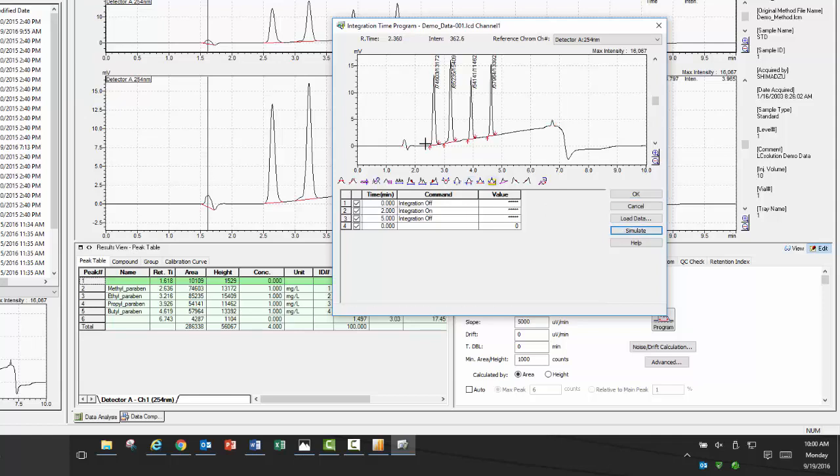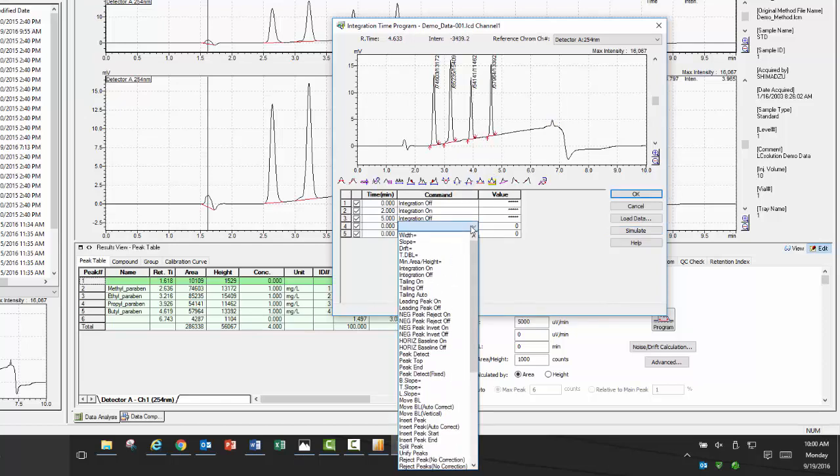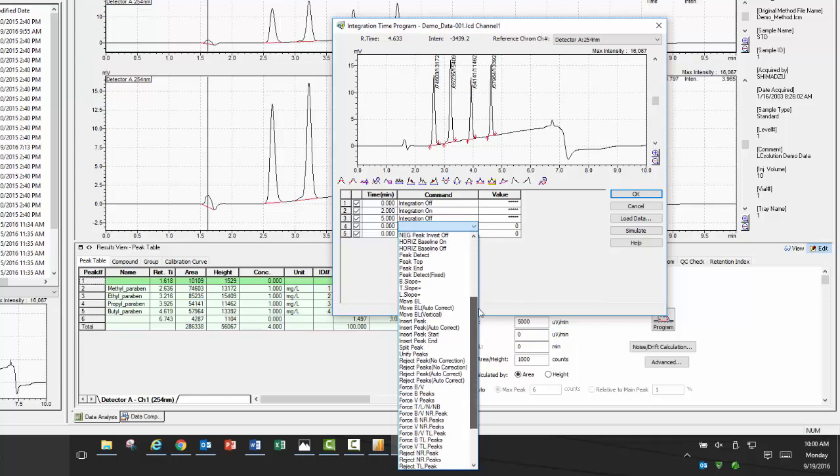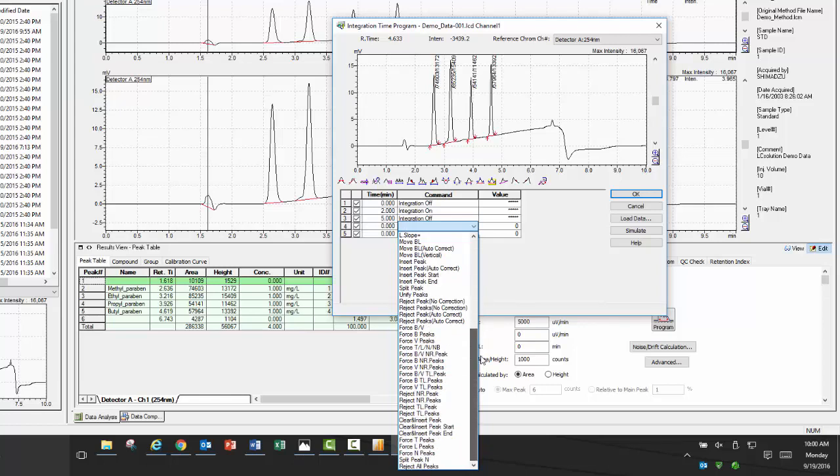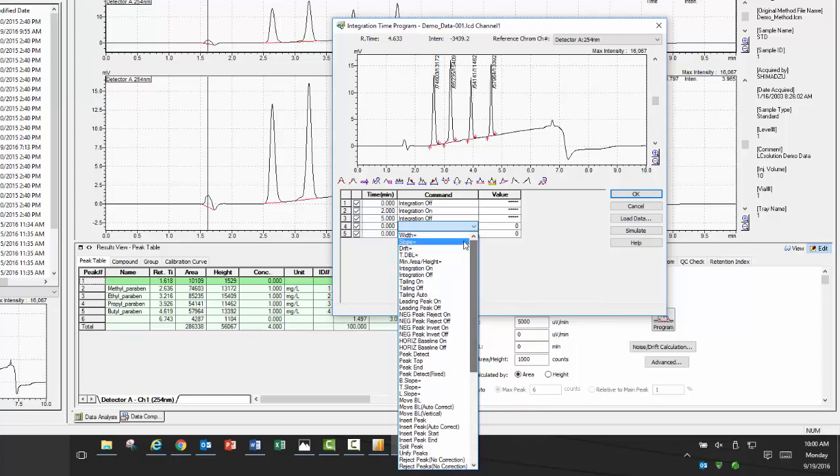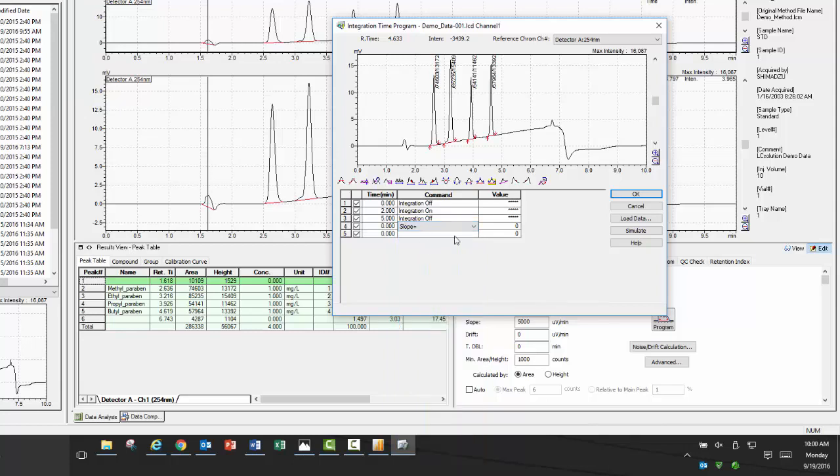Additionally, one of the most useful tools is setting the minimum slope value for integration to start. The units of the slope are in microvolts per minute, so the typical starting value I recommend is 10,000. There are many other tools to use for setting your integration parameters. To learn more about them, press F1 to bring up the contextual help menu.